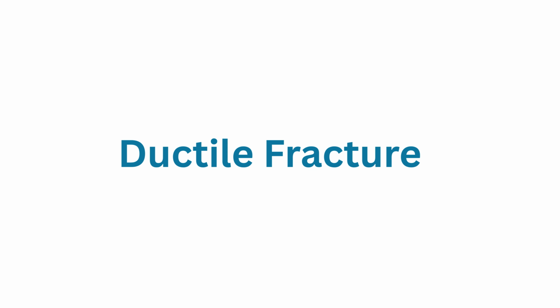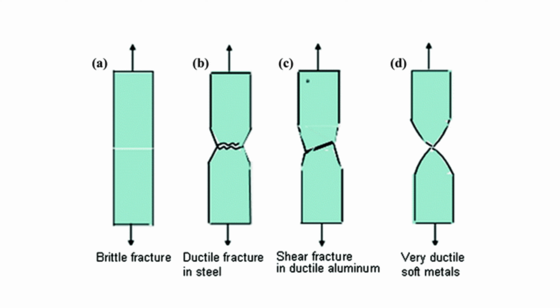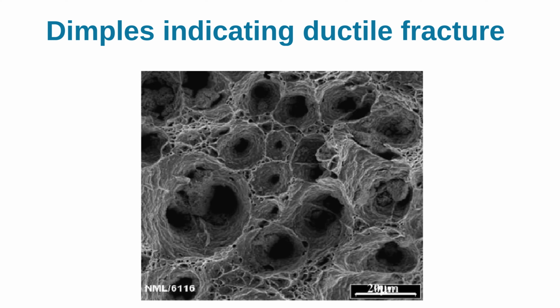Ductile fractures. Ductile fracture involves significant plastic, permanent deformation, necking, and high energy absorption before breaking, with rough surfaces and warnings like dimpling. Usually, the material undergoes necking before breaking. Large deformation of the resin causes fracturing. The characteristic shape of the fracture surface is called the dimple pattern.